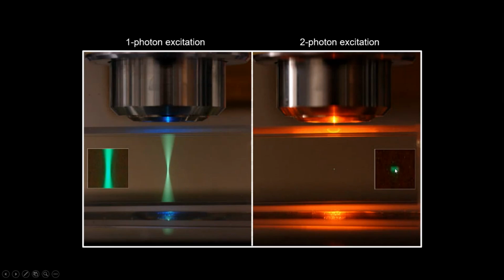So I'm sending so many photons that the chances of two photons colliding and exciting the same fluorophore at the same time is much higher than in the rest of the tissue. I mean, there is light in the rest of the tissue, sorry, but there are not enough photons in the rest of the tissue. The concentration of photons is higher at the focal point, and it's only at the focal point that the two-photon phenomenon will happen.